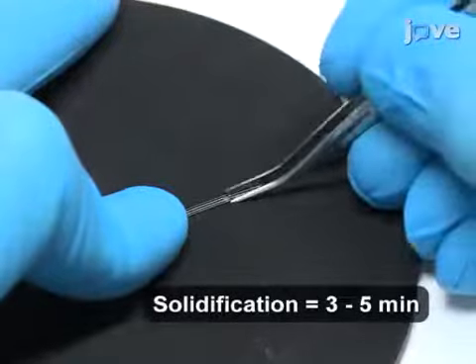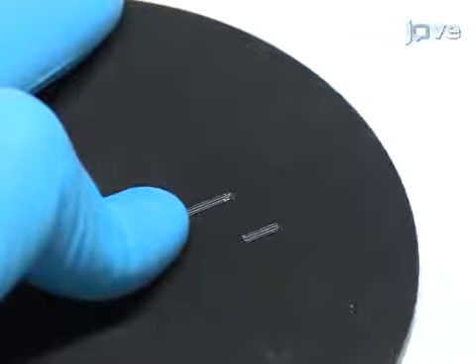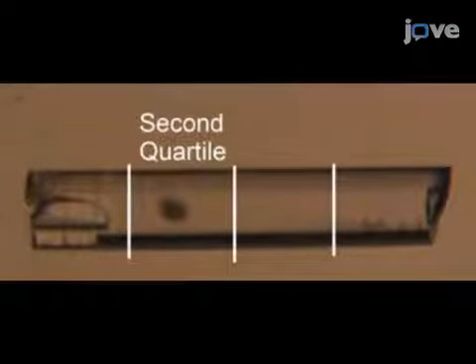When the agarose has solidified, shorten the capillary to a length of about 5 mm. The remaining fragment should be completely filled with agarose, and the embryo should be found within the second quartile.